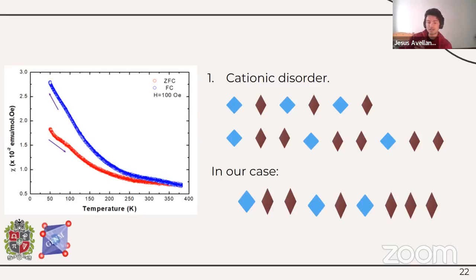But in our case, we could be having something like the following. In reality, titanium and iron do not follow a specific periodicity, so we cannot determine a global, full order of cations in the structure, and this could influence in a considerable way the difference between both curves.